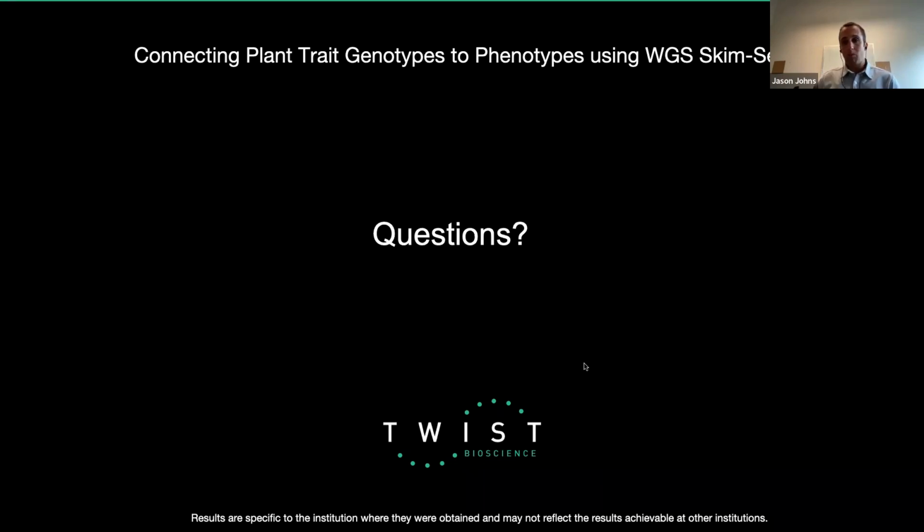But that obviously becomes more relevant if you're trying to do something like impute genotypes. So I meant to plug it in here and I didn't, but I'm involved with a group right now that has developed a tool that's geared toward non-model systems. As this technology is evolving so rapidly and becoming financially feasible for those of us doing ecology and evolution, it's important to be able to figure out what to do among this sea of different techniques. So it's called marine omics. If you Google marine omics, then it'll come up.